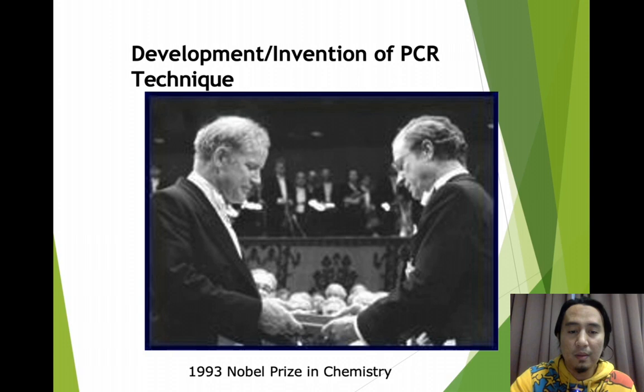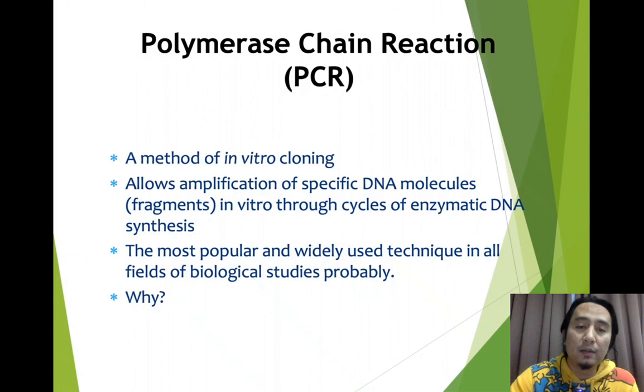Right, so polymerase chain reaction, PCR, is an in vitro cloning method. It allows amplification of specific DNA molecule fragments in vitro through a cycle of enzymatic DNA synthesis. It's probably the most popular and widely used technique in all fields of biological studies, because PCR is a really powerful tool in molecular biology nowadays.